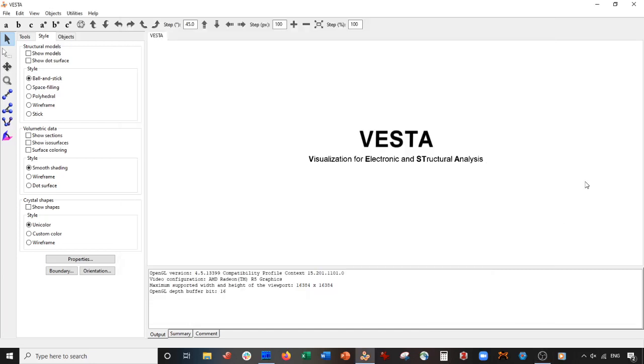Hey everybody, welcome back for another exciting Vesta tutorial. Today we're going to be doing something a little new. We're going to actually be making alloys using Vesta. We're going to be making two copper alloys: brass and bronze.